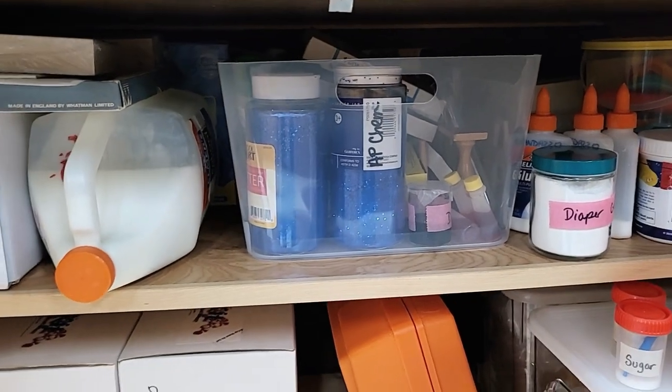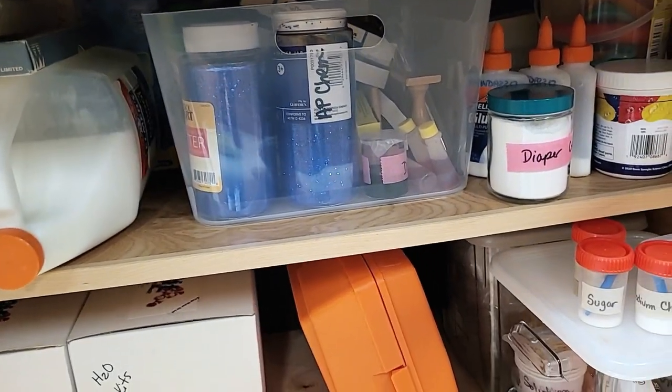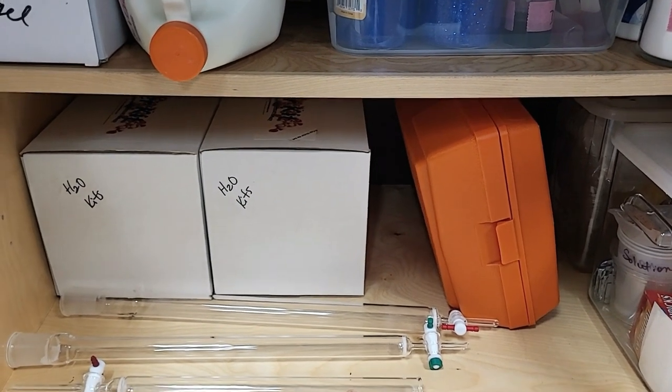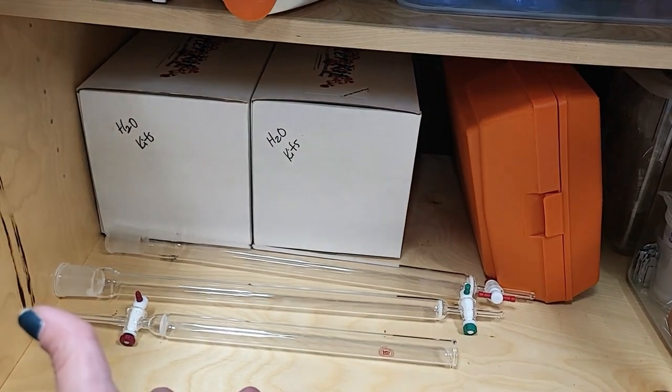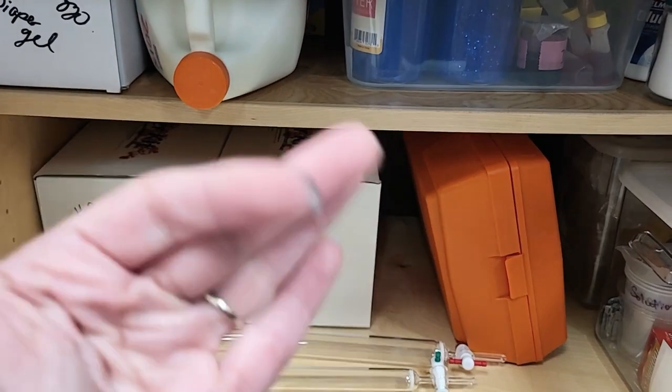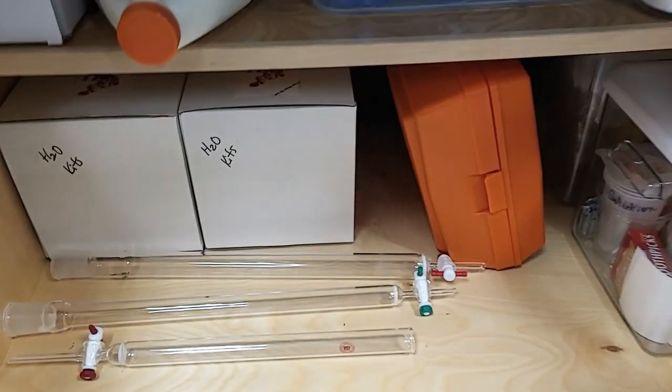I again have the blue glitter lab stuff, right? I do a diaper gel lab with the kids. I've got a distillation kit, some column chromatography based stuff. So this is all my intermolecular forces stuff. I thought gases and intermolecular forces kind of made sense.